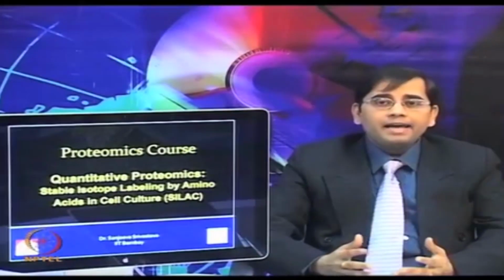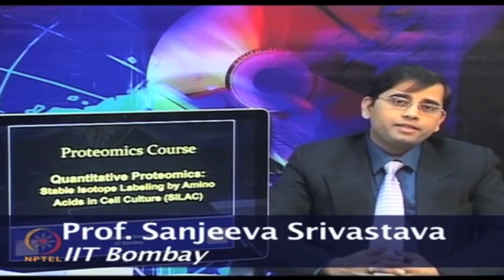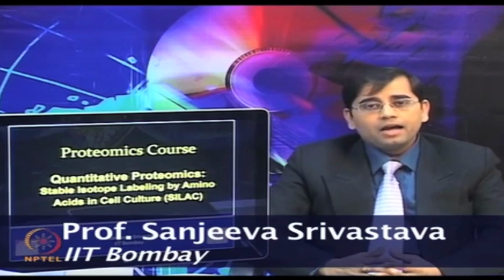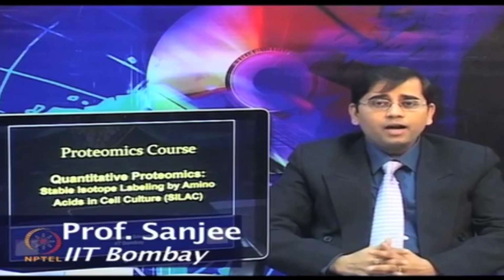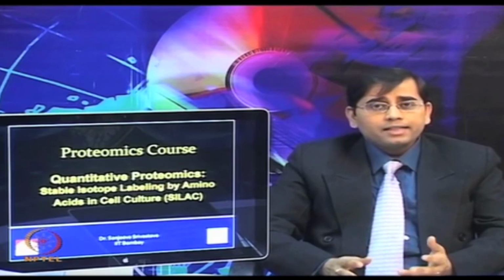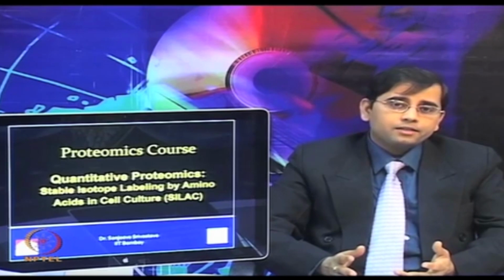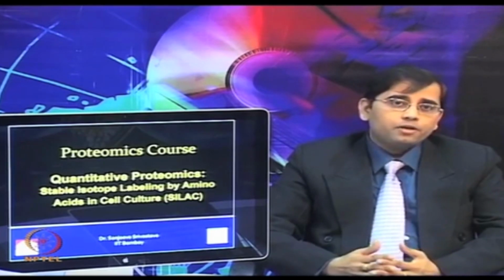The complexity and dynamic nature of the proteome present major technological challenges. Mass spectrometry advancements have improved the high throughput identification and quantification of proteins. Mass spectrometers have advanced significantly and are now offering opportunities to understand human diseases and discover biomarkers.